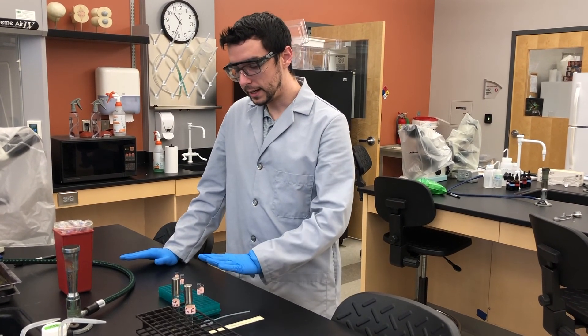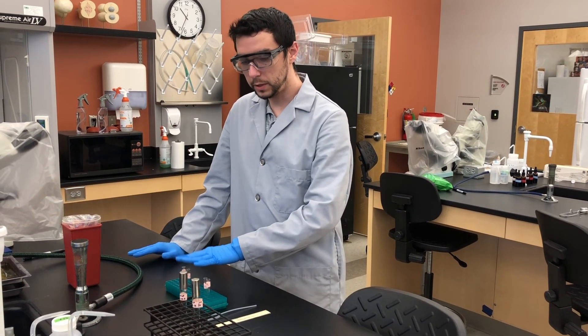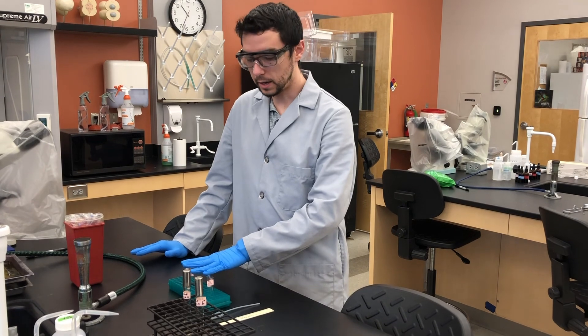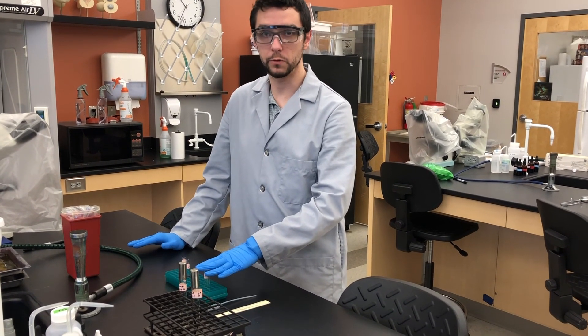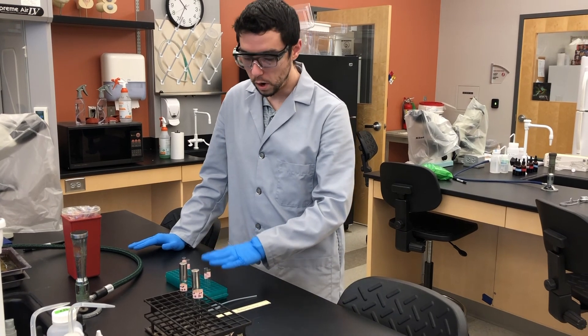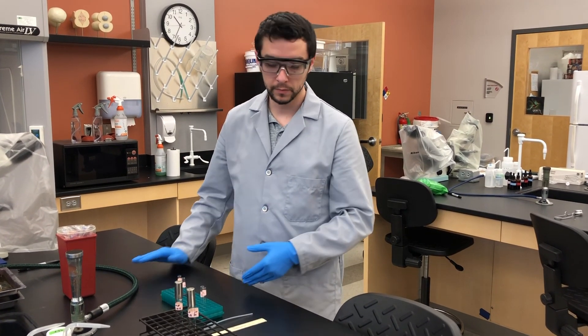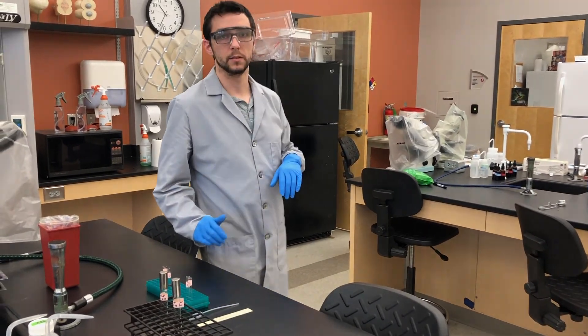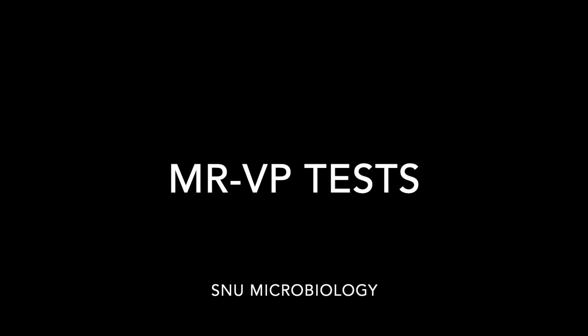Once you have your results, take a picture of them, then dispose of the materials properly in the waste bucket — especially because alpha-naphthol and potassium hydroxide are caustic and must be disposed of appropriately. And that is the MRVP video. Thank you.